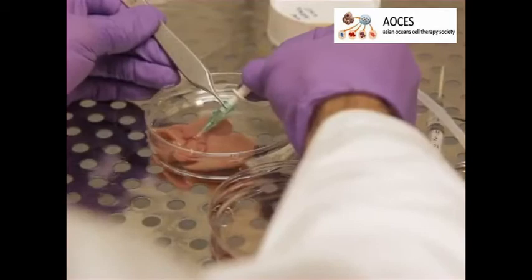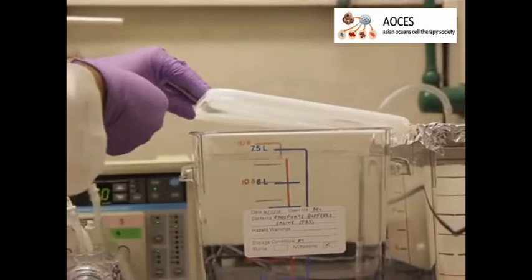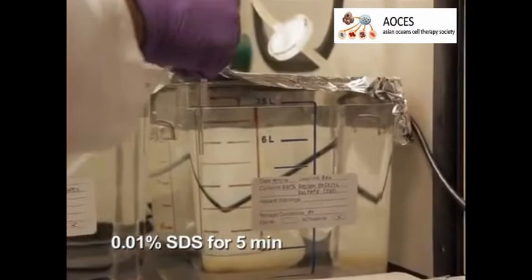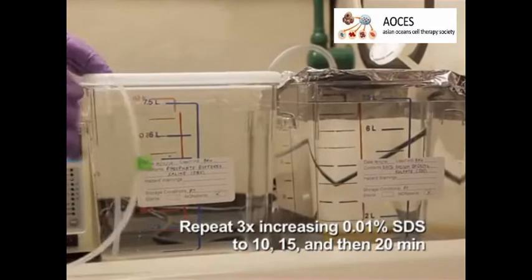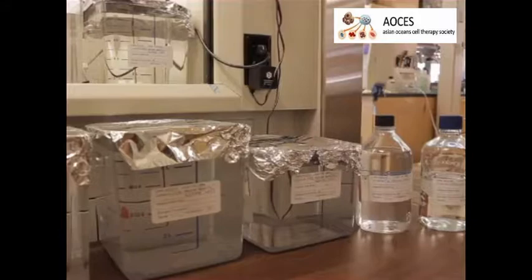Carefully transfer the harvested liver into the petri dish of PBS and allow it to perfuse overnight. The next day, perfuse the liver with 0.01% sodium dodecyl sulfate, or SDS, in distilled water for five minutes, then switch back to PBS for one hour. Repeat the SDS and PBS perfusion steps three more times, increasing the SDS perfusion time to 10, 15, and then finally 20 minutes.